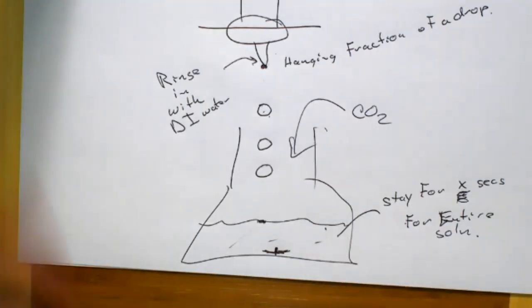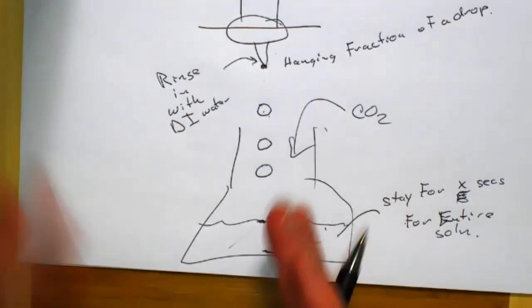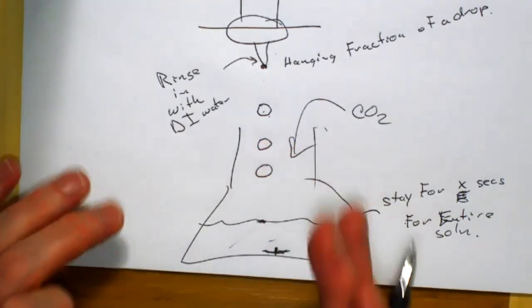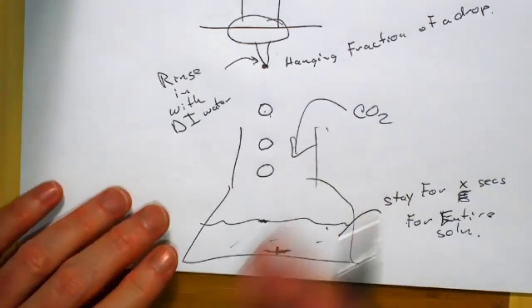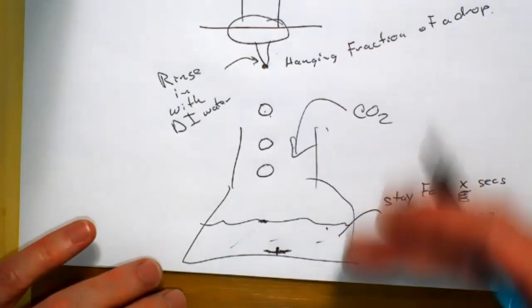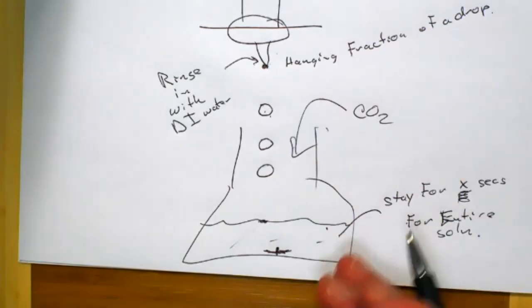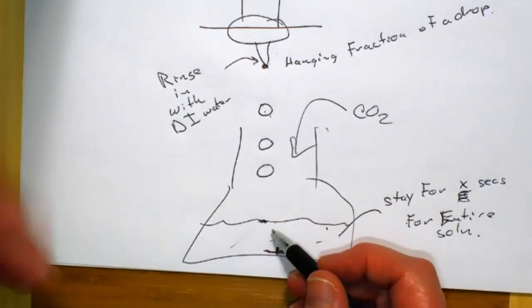It depends on your preference. I like to make it fairly clear that it's pink. I go a little heavier pink, but I do that in the standardization and in the analysis of the unknown, and then they cancel out. Some people like to go, is that pink? And they're like, yeah, I can see it.